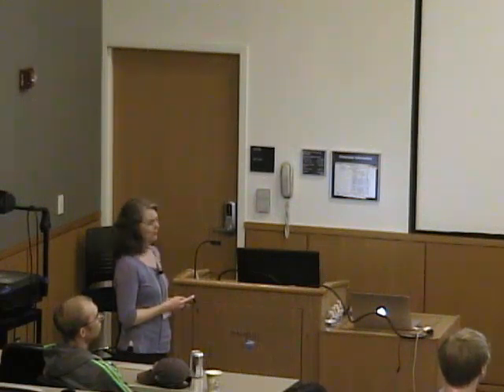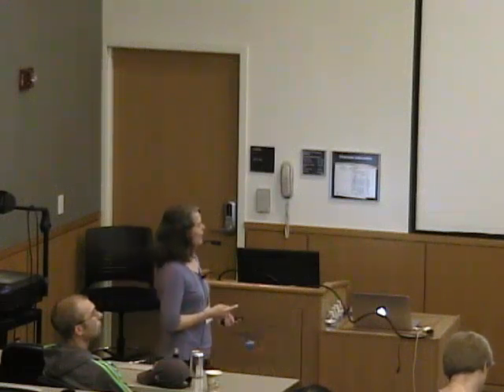Okay, so just a few things to remember as you go off for coffee and go home. First, I hope it's obvious now, yes, you can take spectra of paramagnetic molecules. Yes, the lines can be broad, but we are not shying away from broad lines and other methods that we use here. So why should broad lines stop us from working with NMR spectra, right? And if you're willing to delve into those line widths and those chemical shifts, you can get a wealth of information about both molecular structure and electronic structure.